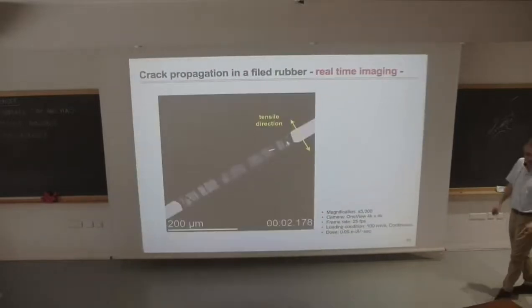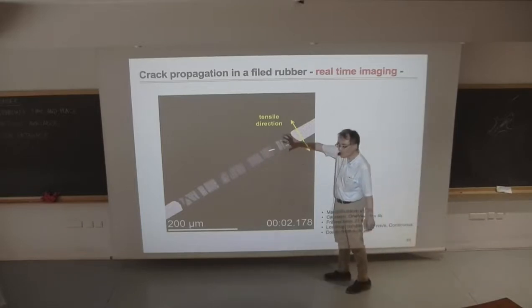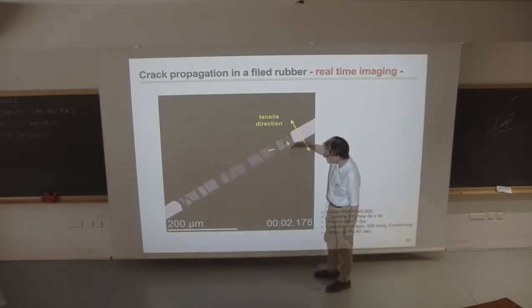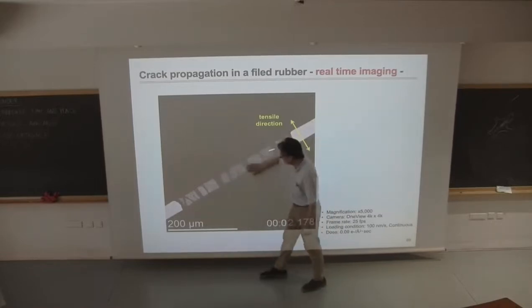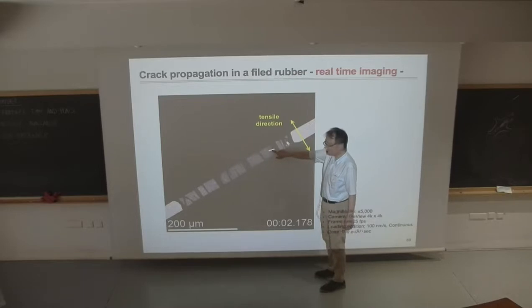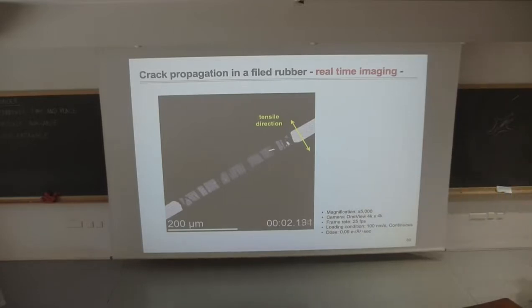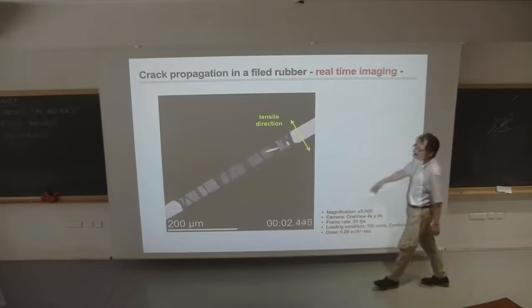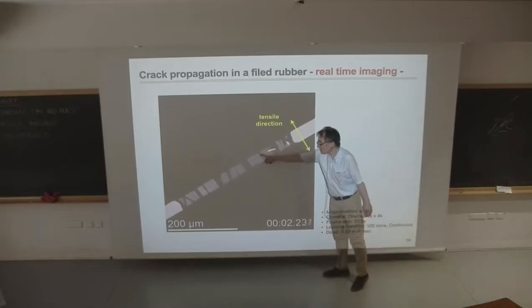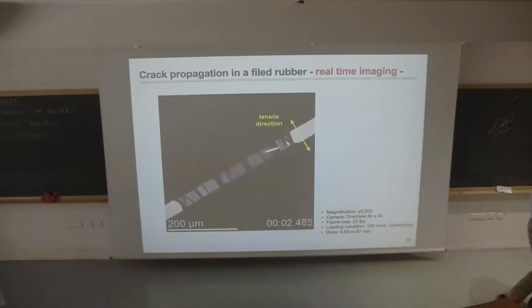Okay, this is a stretching experiment. Sometimes this is a very low magnification image. This is a gap of the cartridge, and this is the sample. In some cases, we find a hole in the sample, and then we further stretch it. Then we can observe the crack propagation under the TEM.